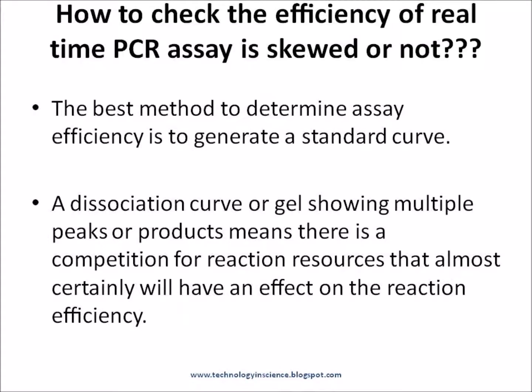The best method to determine if assay efficiency is skewed is to generate a standard curve of template diluted over the range that will be encountered with unknown samples, and look at the efficiency over that range — it should be as close to 100% as possible. A dissociation curve or gel showing multiple peaks or products means there is competition for reaction resources, which will almost certainly affect reaction efficiency.